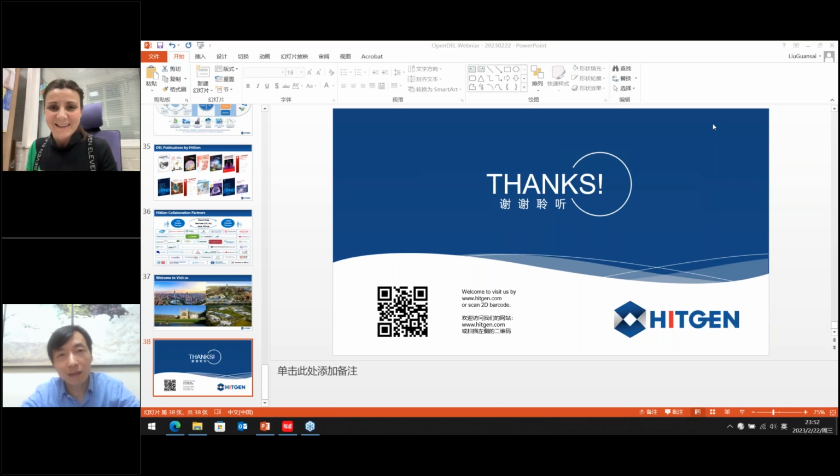That's my suggestion because that is a little bit more complicated than the traditional one. As I just mentioned, we will offer a DEL selection menu to our users, but that menu is much more about the traditional DEL selections. For a complicated one, for example, the RNA target selection, that has to depend on the expertise from the customers, whether they are familiar with the RNA target and also some of the details on the selections.